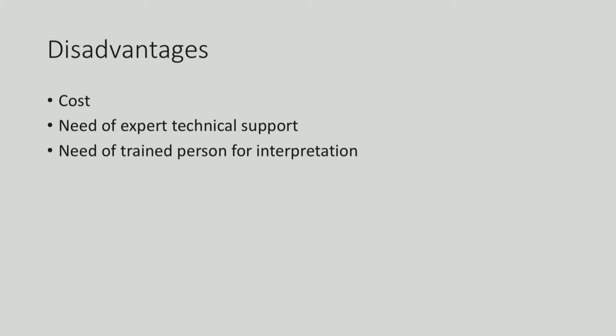That's why most centers don't have their own flow cytometer. We have a flow cytometer being used in research, and now pathology is also offering the test. With this, I conclude my presentation. Thank you very much.